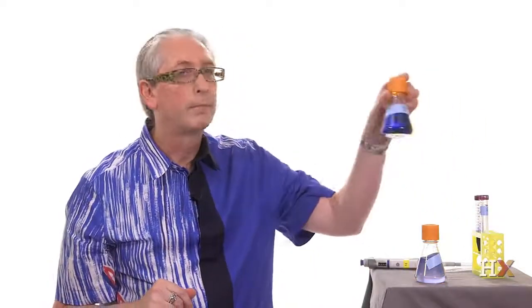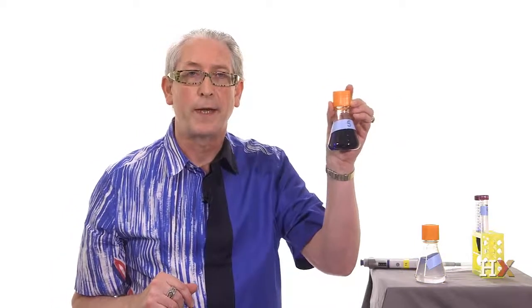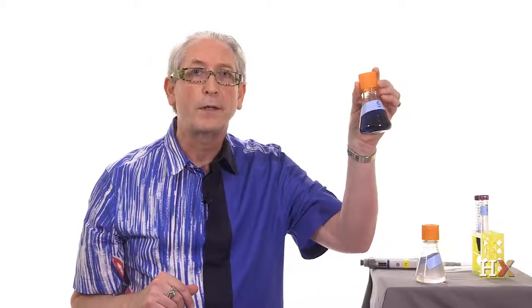Let's go back to our second flask, the one that was labeled S. It was resting when I was talking about the other reaction, but it's still blue. It was not bleached. What did happen? Well, remember, I didn't tell you that this flask contained glucose. In fact, it's not glucose, but sucrose. So what's the difference between glucose and sucrose? I shake the solution with glucose in it, it turns blue, but gets bleached again, while there is no bleaching of the solution of sucrose.